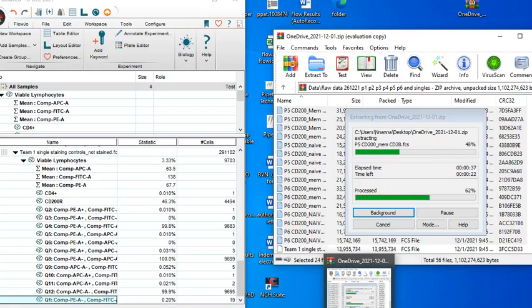So we are still waiting on the sample. Once it's gone, we'll look at just one analysis before we call it a day. We'll come back again to show you how we gate forward the cells and what else we do with the Flowjo and how we can extract information from the Flowjo to Excel. In another analysis, we'll be looking at how to use Excel to analyze your ELISA reports, to draw your concentration curve with ELISA. And then we'll also look at your qPCR, how to analyze data with your qPCR on Excel.